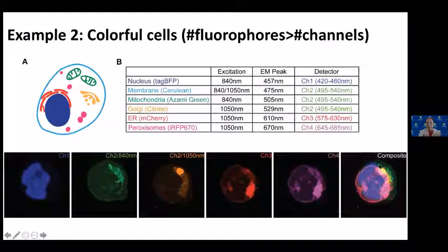And this is our raw image from our system, and you can see that in between those channels there is a lot of signal overlap, and also the signals are not specific to a biological structure, and the output is very ambiguous.